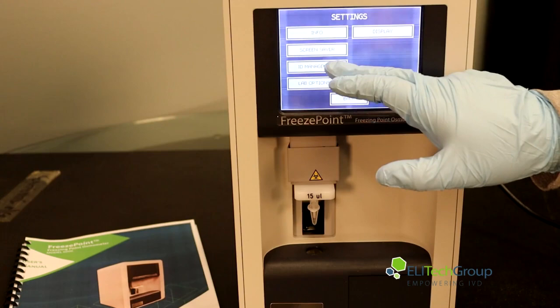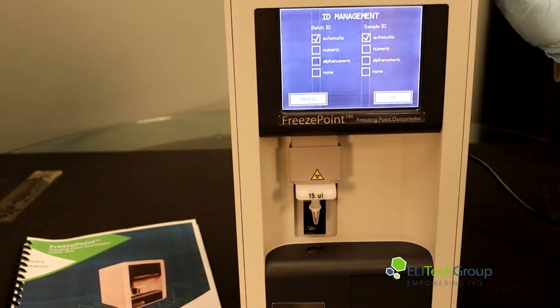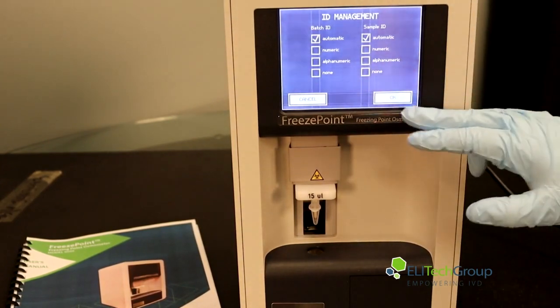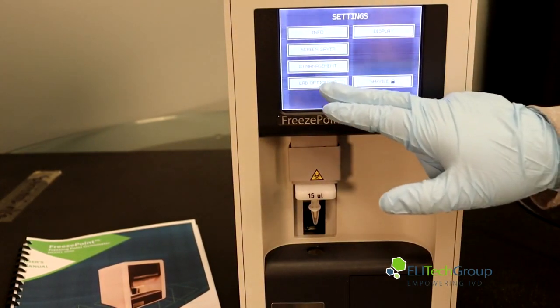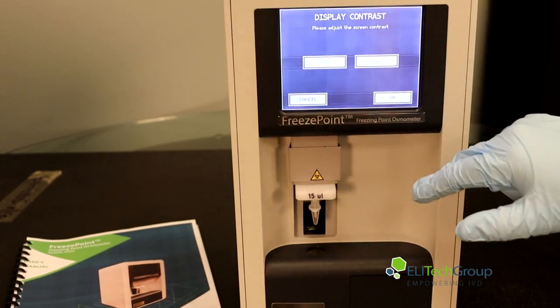You can go to ID Management, which will allow you to set IDs automatically and adjust it when you add a barcode scanner as well. You can also go into your display and adjust the contrast either way.